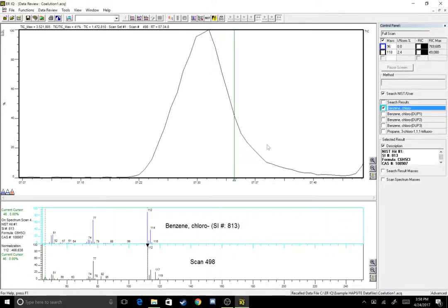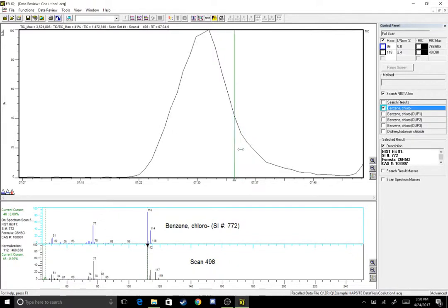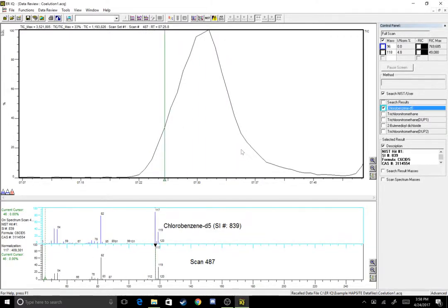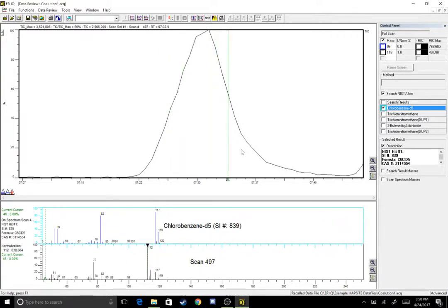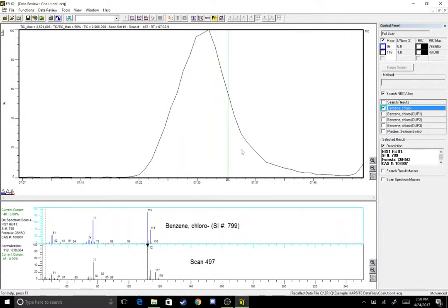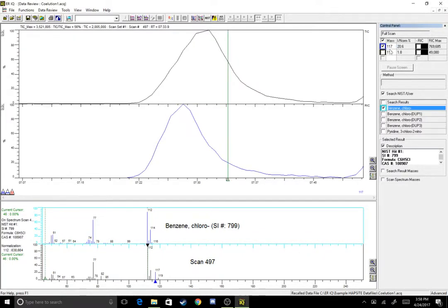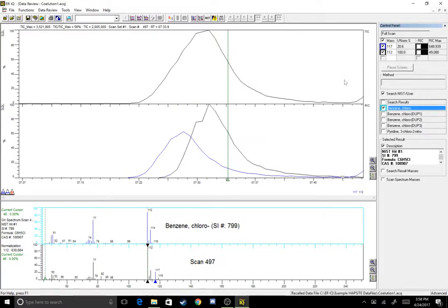So now that we've identified that there is co-elution, I like to visualize the co-elution. So let's take our main ions. We had 117 toward the beginning of the peak and toward the later end of the peak I think we had 112. So I'm gonna go ahead and plot those here. So let's do 117 in blue and then in black we'll do our 112. So this is what the two different chemicals under that one peak are gonna look like.